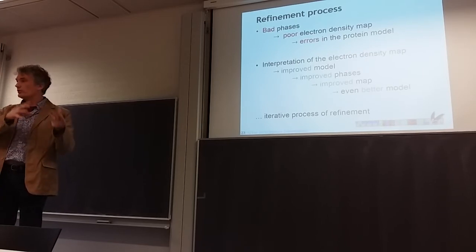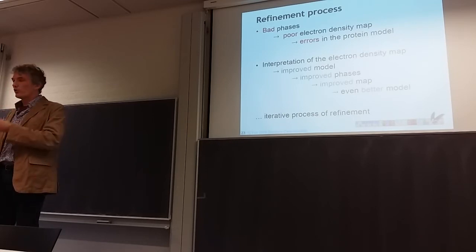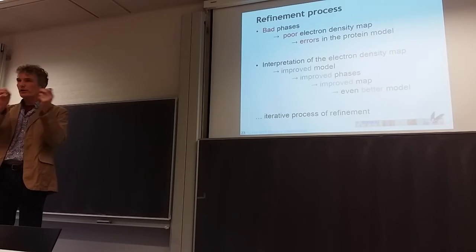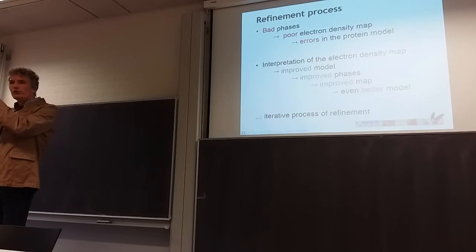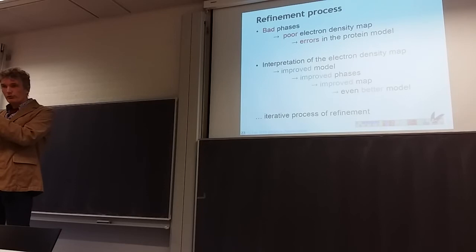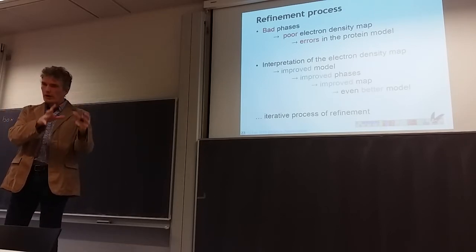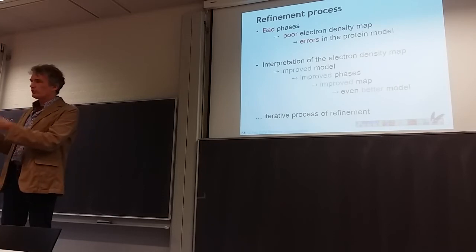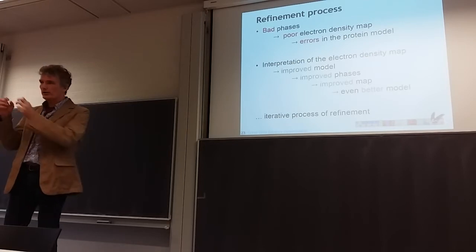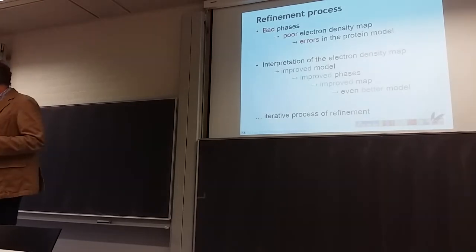And depending on the quality and the amount of experimental data that's there, it's more or less a mix of that. So ideally, you would like your final three-dimensional protein structure to be just a reflection of the measured experimental data. But as the data becomes less quality and less in quantity, it's going to be more of the model and less of the data that actually ends up in your PDB structure. Yeah. Okay.